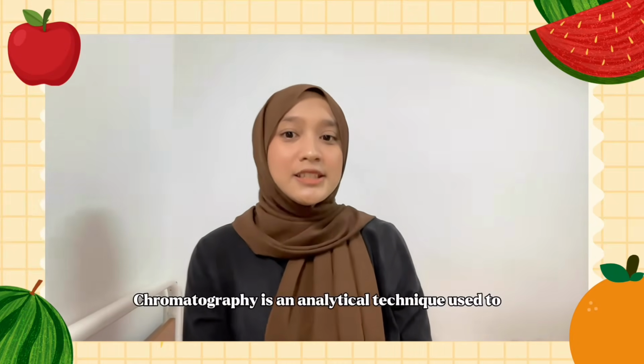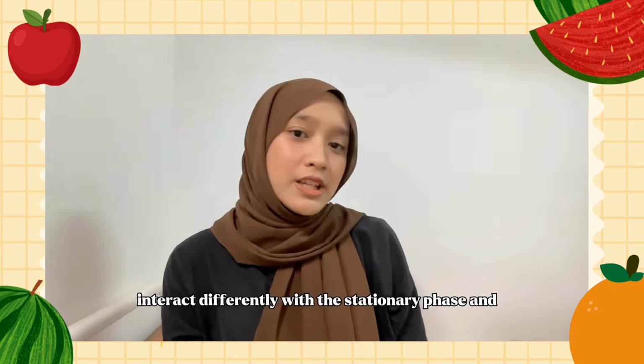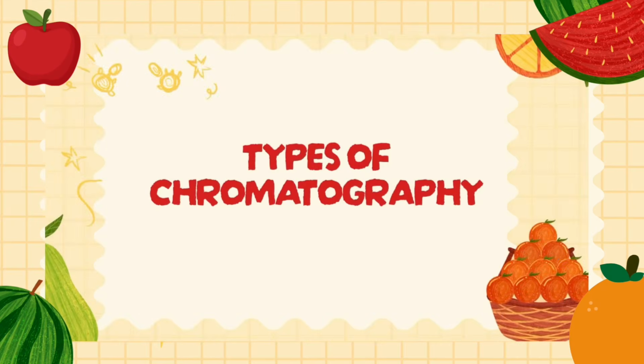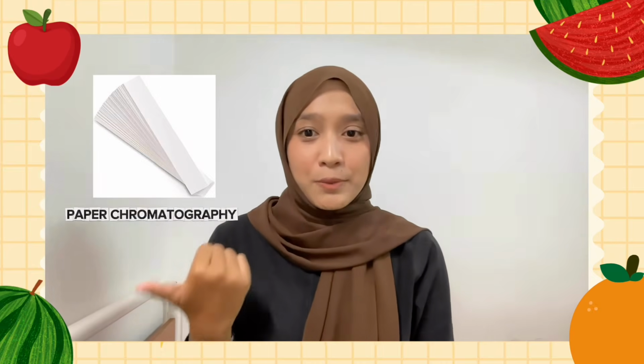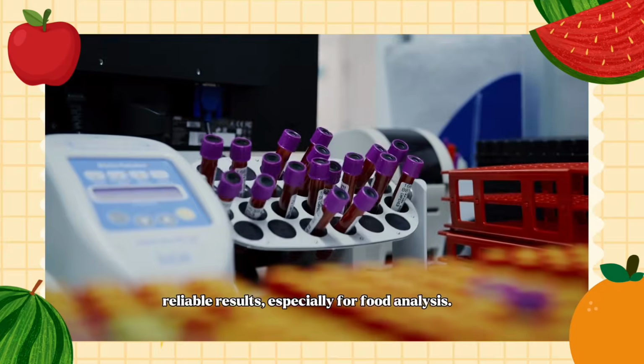What is actually chromatography? Chromatography is an analytical technique used to separate, identify, and quantify the components in a mixture. Separation occurs because different substances interact differently with the stationary phase and the mobile phase, causing them to move at different speeds. Have you guys ever wondered how many types of chromatography we have? There are several types, including paper chromatography, thin layer chromatography, which is also known as TLC, and high performance liquid chromatography, or we call it HPLC. HPLC is widely used because it provides accurate and reliable results, especially for food analysis.